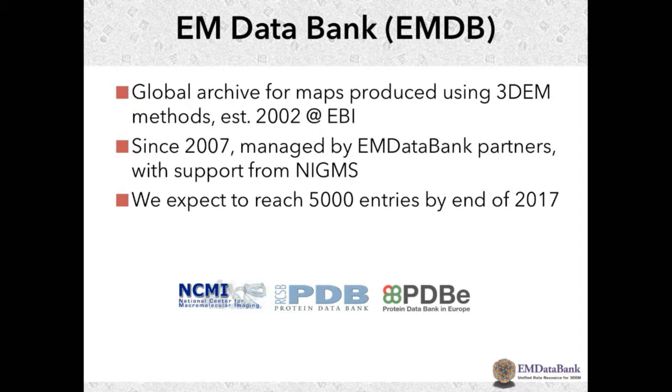We formed the so-called EM DataBank Unified Data Resource Project. And again, this is taking off like hotcakes. We expect to reach 5,000 entries by the end of 2017. Pretty exciting.